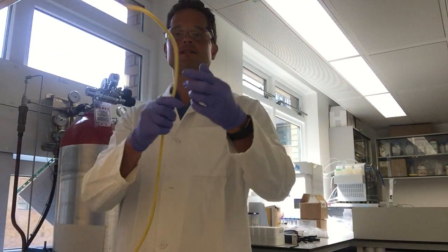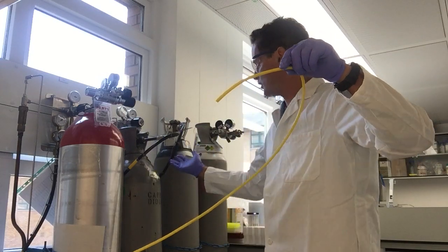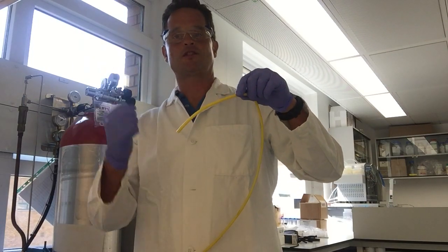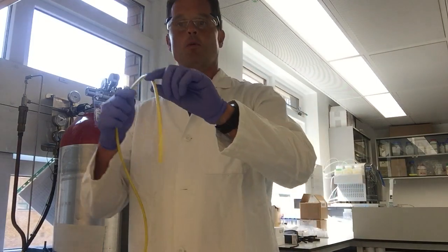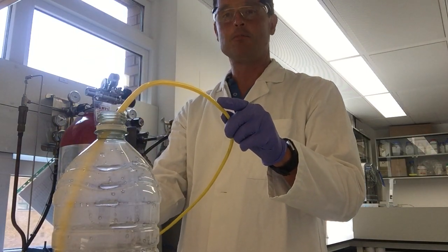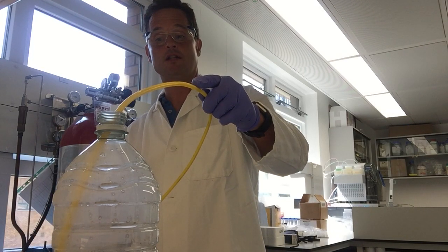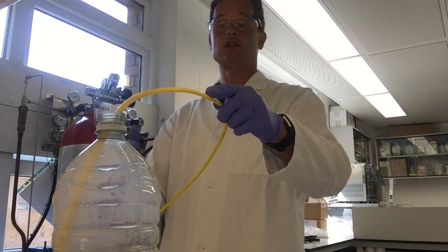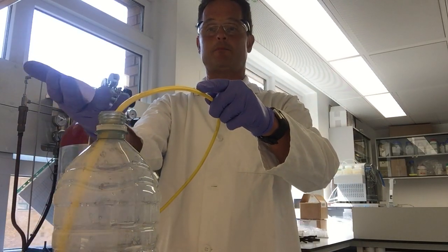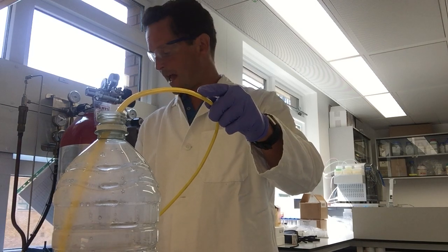And what I have here is my pipe that delivers CO2. The CO2 is delivered from one of these cylinders here, but it could come directly from the atmosphere, or it could come from a smokestack of a fossil fuel power plant. So what I do now is put that tube into my PET bottle with the sodium hydroxide solution, and then I add the CO2 just above the solution. I wait for a minute or so, because I would like to fill the empty space above the solution in the bottle with carbon dioxide, and then we will see what's happening in this experiment.